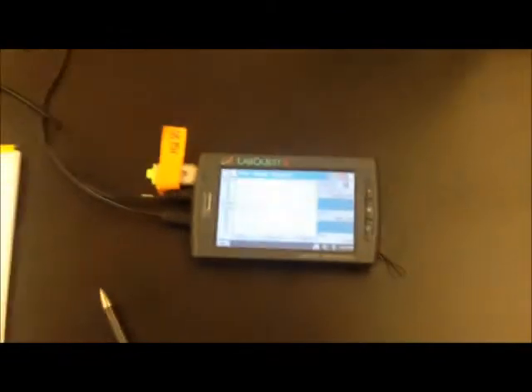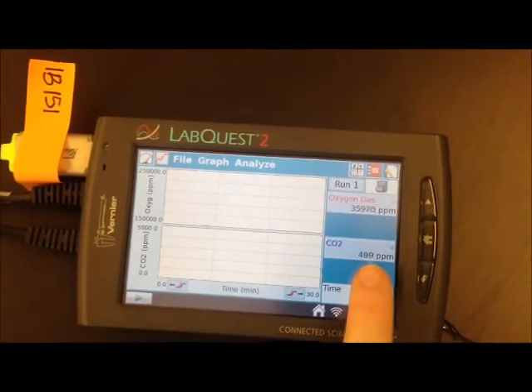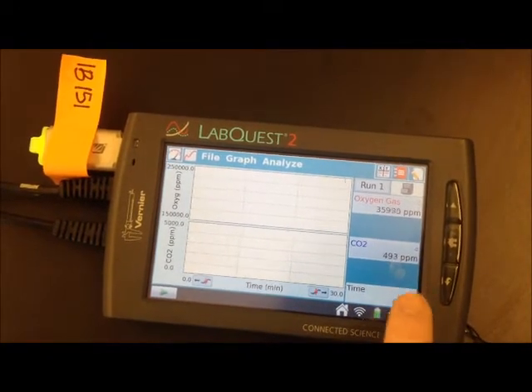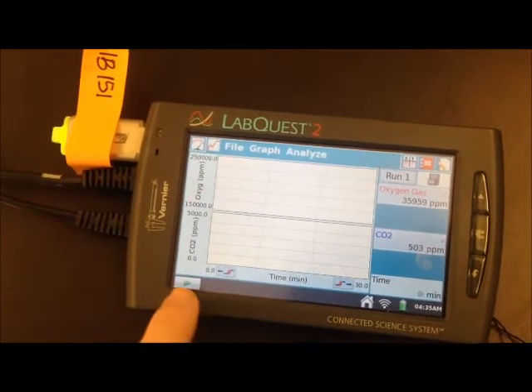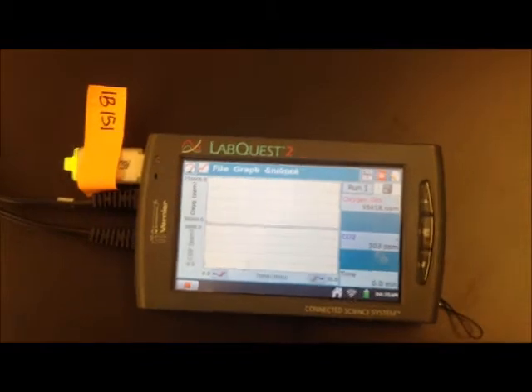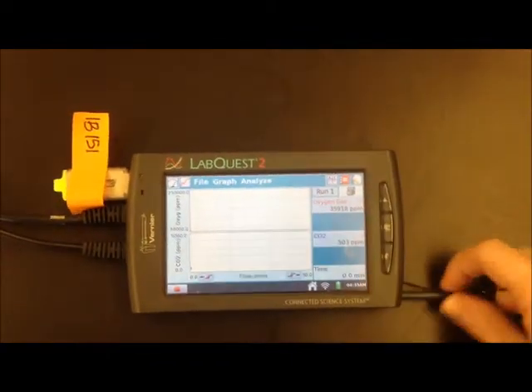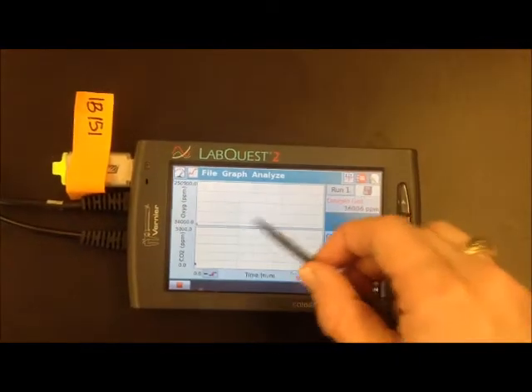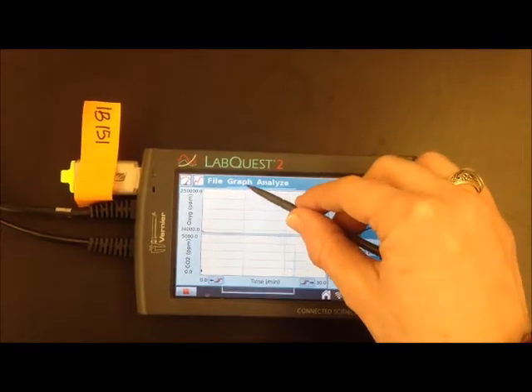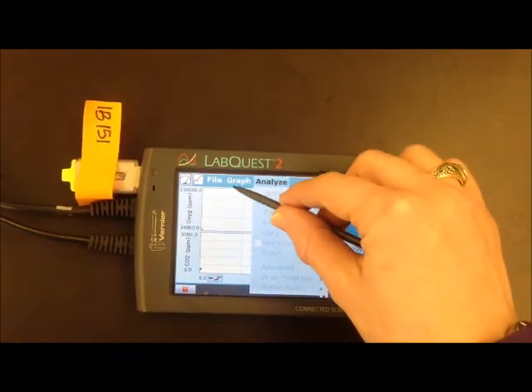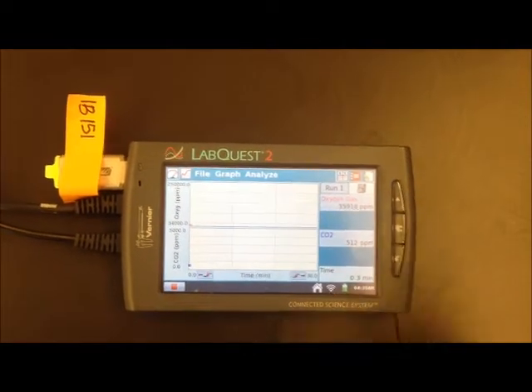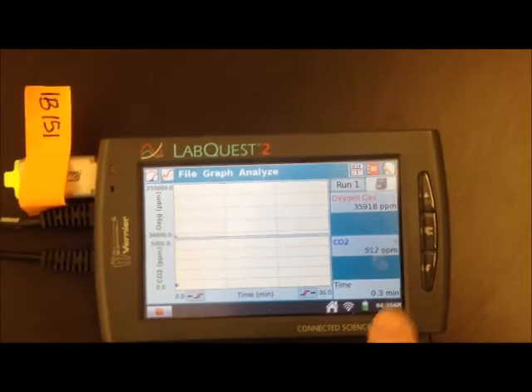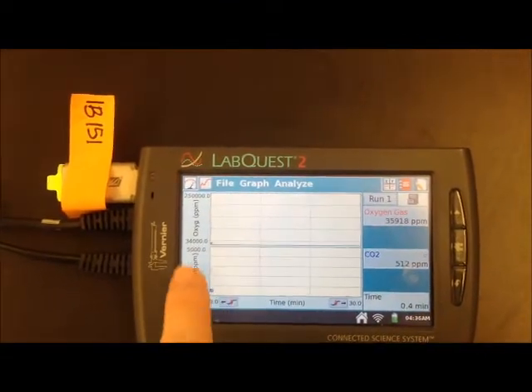With this setup, you can see they're all connected and it's running properly — it's reading because the values are changing slightly. Right now we have not started it so the time is at zero. Once you click the green button it will start. The other cool thing about this device is that there's a pen tool if you want to use that to tap instead.